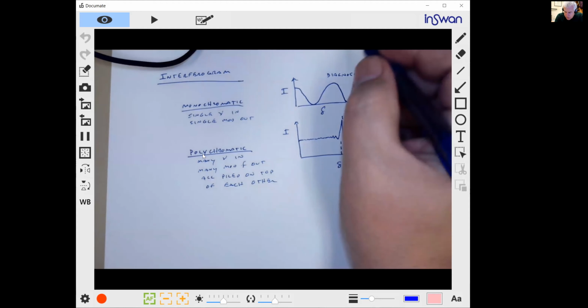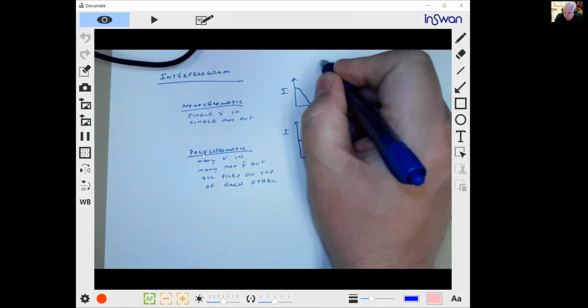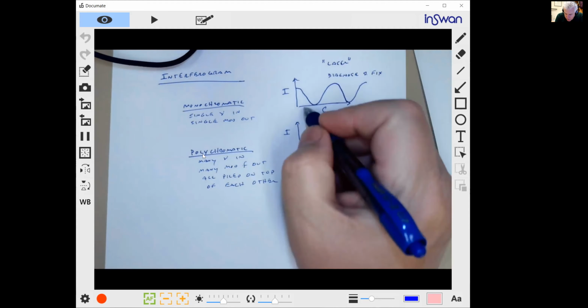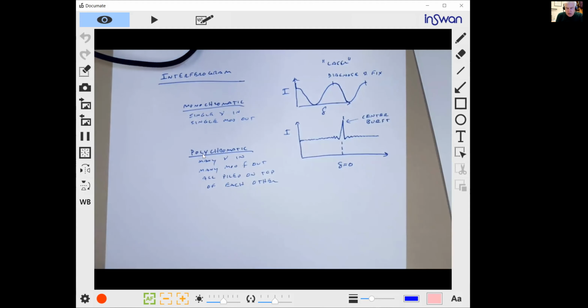and so the laser, you can typically they use a red laser, right? And the red laser goes in, and it just creates this interferogram. And then at what frequency these peaks are coming, you actually lock the mirror travel onto that interferogram.